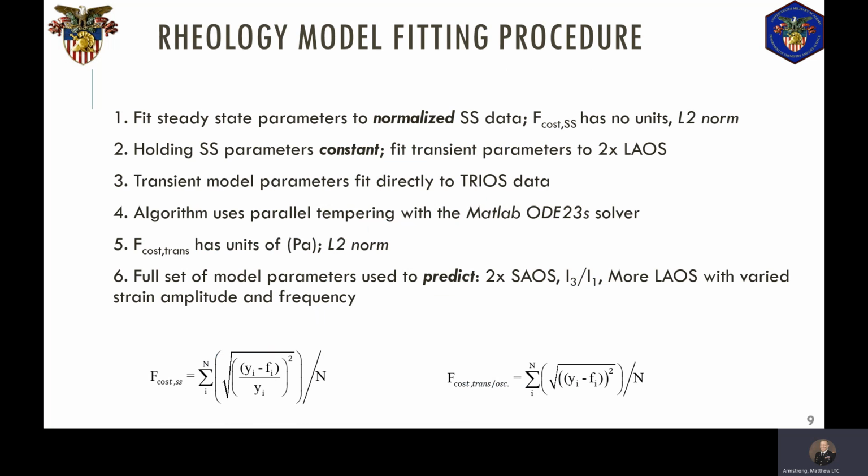And so let's start off with that top corner. We're going to take a series of rheological experiments from steady state, step up and step down experiments, and then we're going to fit a rheological model. We're going to pin down some parameters, and we're going to make predictions of more complicated flows. In this case, it will be small oscillatory shear flow.